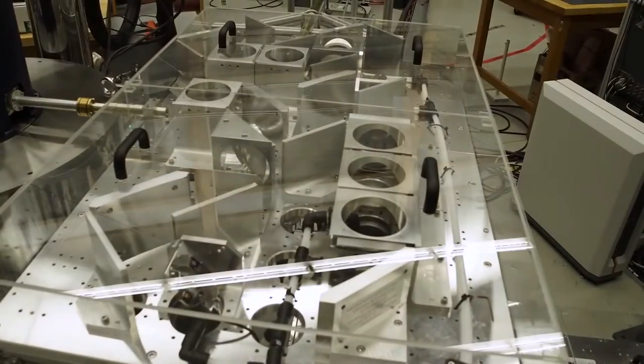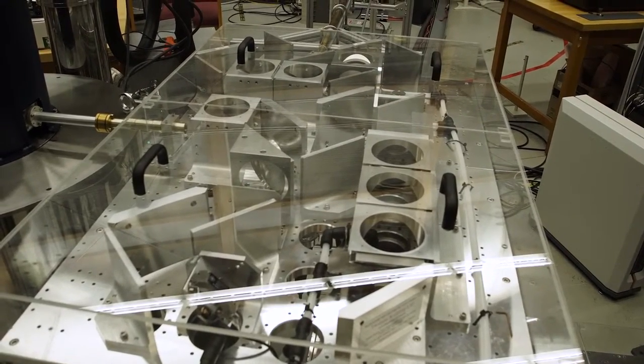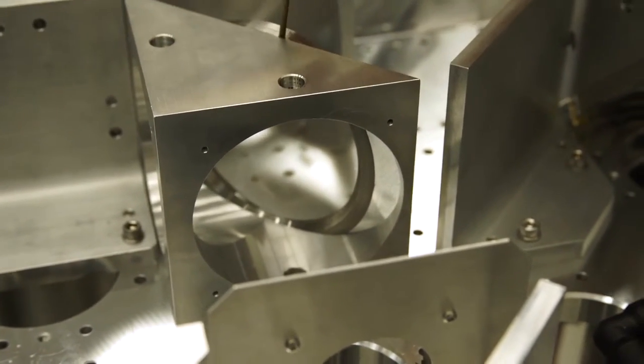From this output microwave power we direct the beam via a quasi-optic table. In that quasi-optic table we have a first component being a beam splitter, which allows the beam to be split into two halves.